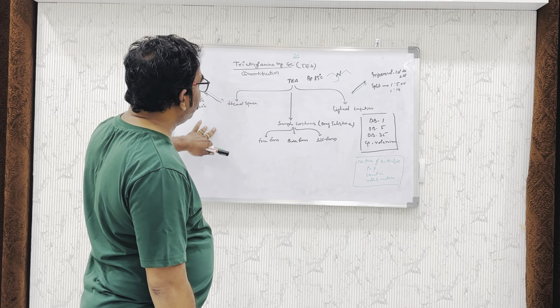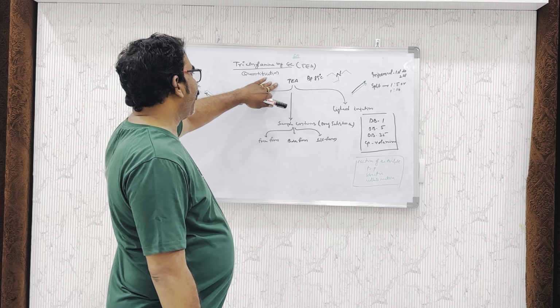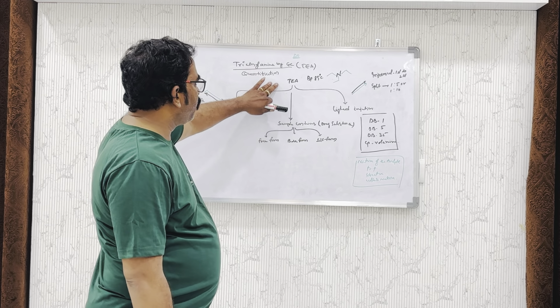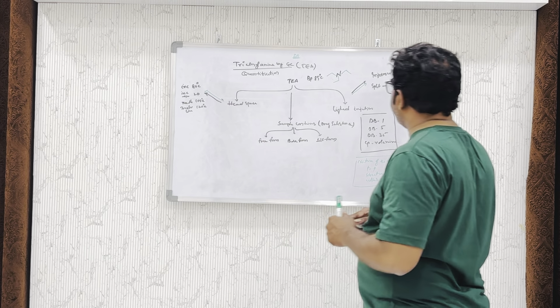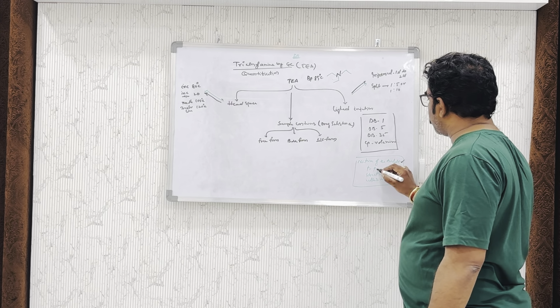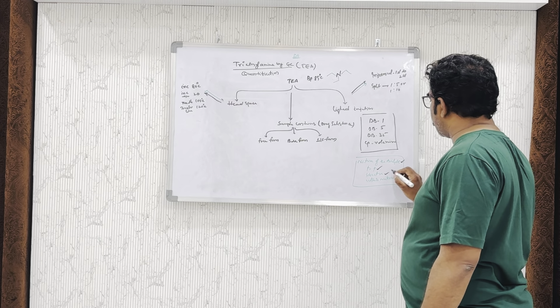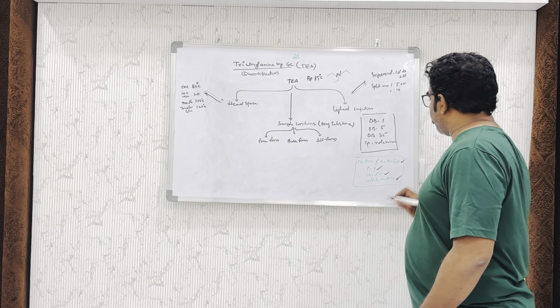For example, when we are developing the analyte by GC, we need to consider these points. The first one is the nature of the analyte, which is very important, and the boiling point is also very important, and the structure also, and one more, the volatile nature.